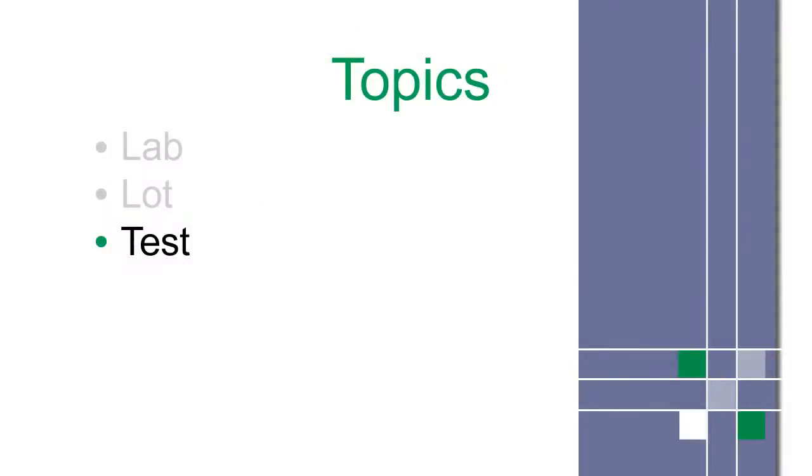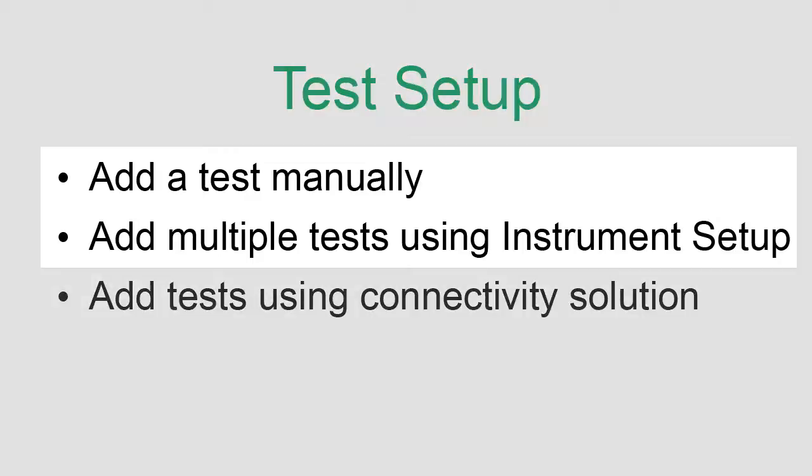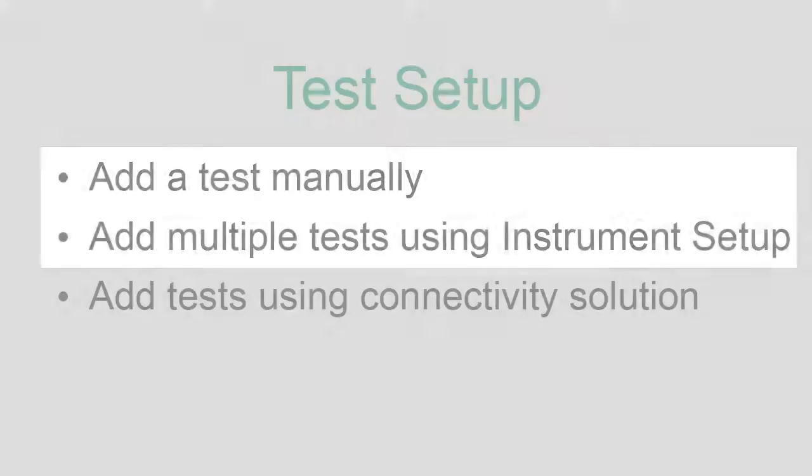Now let's look at the setup of tests. There are multiple ways to set up new tests. Some customers add a single test manually. Others add multiple tests using the Instrument Setup feature. And some are required to add tests using their connectivity solution. We'll focus on the first two.